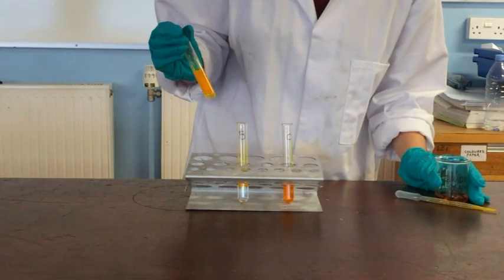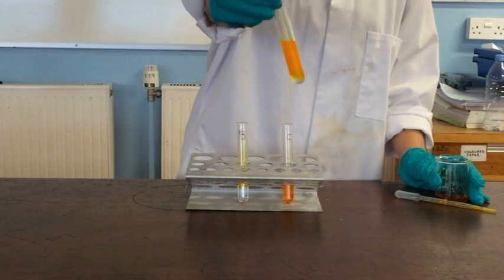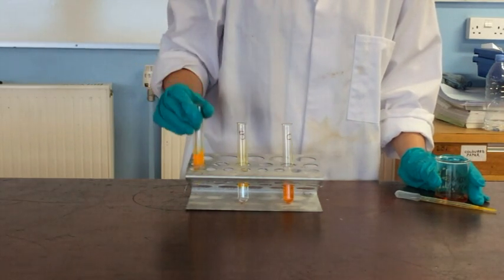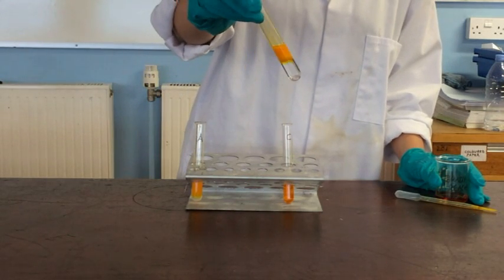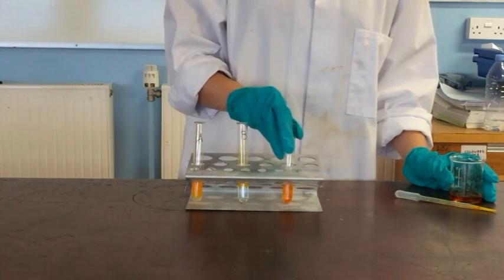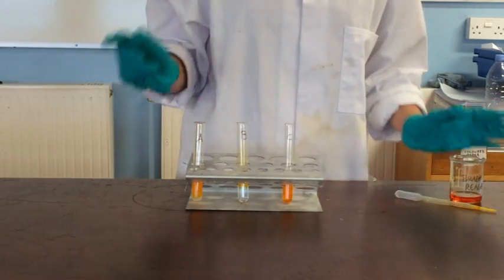So there we go, in A we've definitely got an aldehyde or a ketone. You can see the orange precipitate there. And also in B you can see there is an orange precipitate. C has not formed a precipitate and so it's not an aldehyde or a ketone.